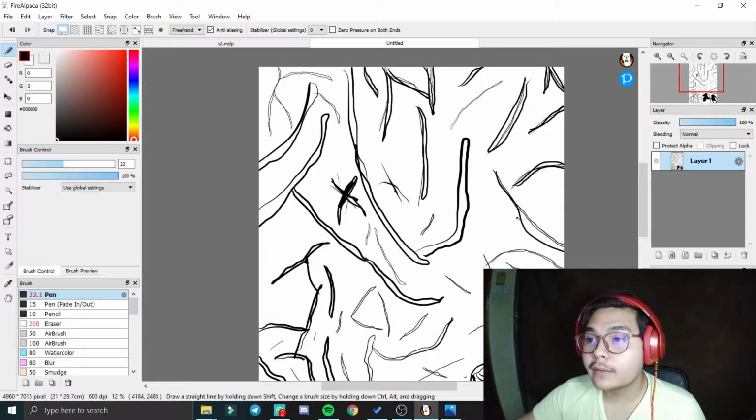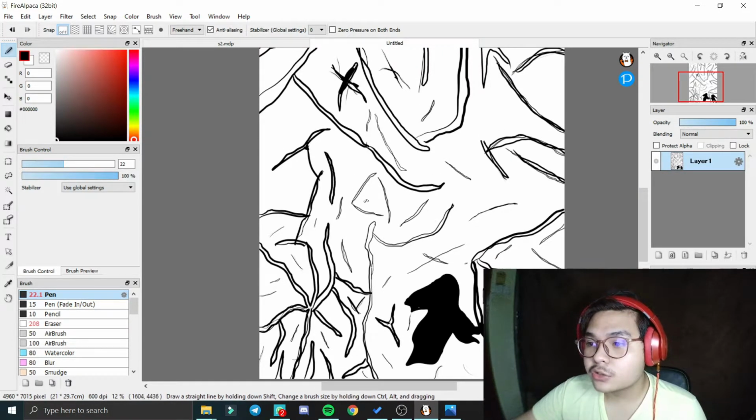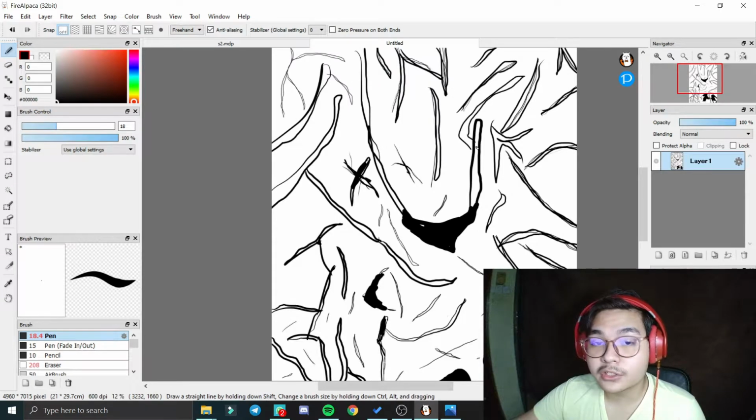And then thirdly, we have grey cast iron. So the dark line or worm-like shapes are graphite flakes. The white region is the alpha ferrite matrix. The graphite flakes show the fracture of the surface.